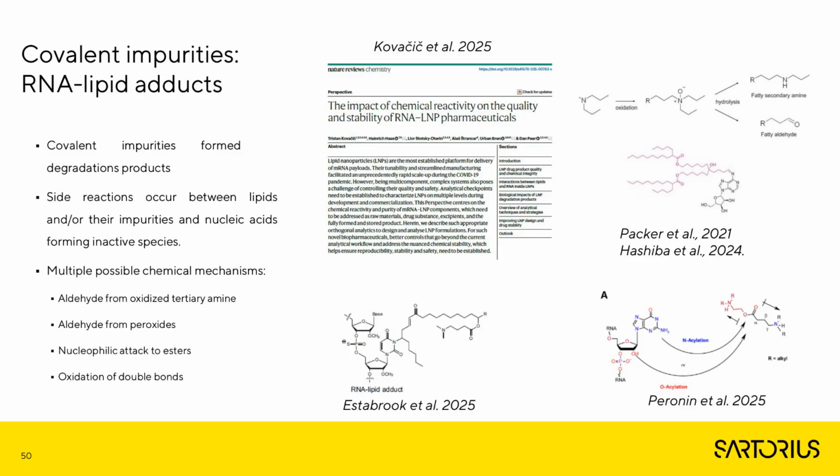This is because of the special chemical environment within the formulations, and we are forming these covalent impurities between nucleotides and lipids, which means that we are decreasing the efficacy of the RNA within the drug product. This has been shown in some articles. There's a few different structures of these impurities available.